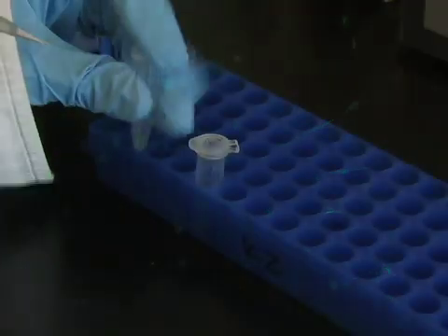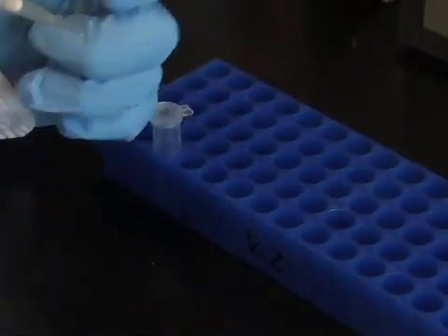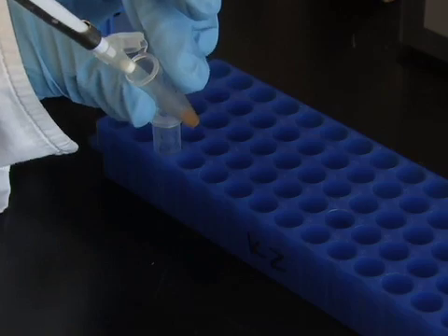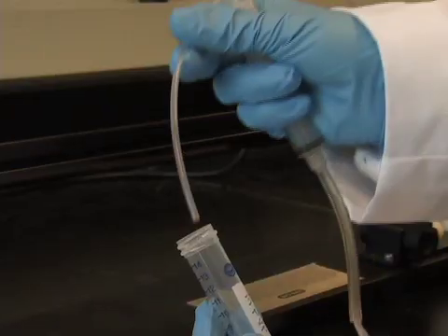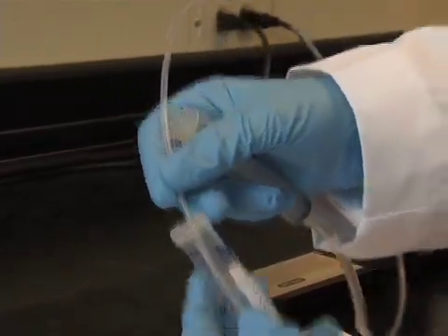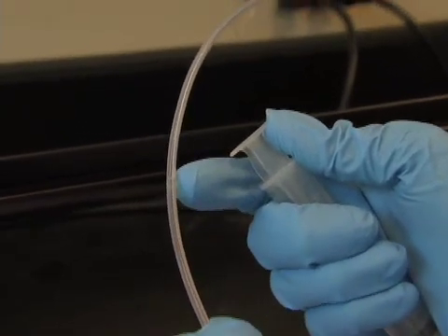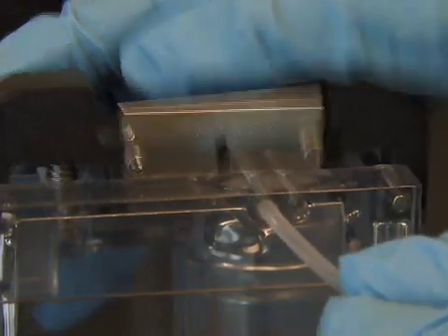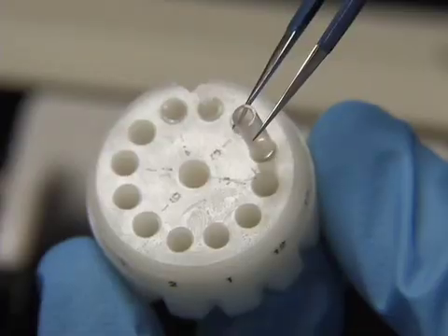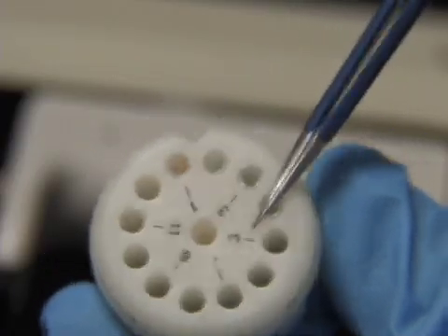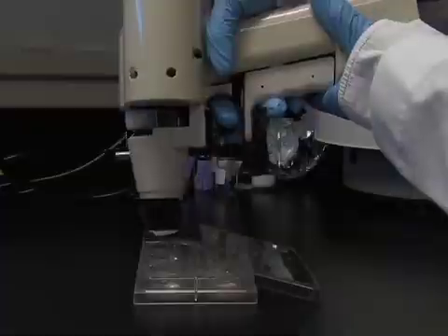The basic steps underlying biolistic transfection are to: 1. Coat gold particles with the DNA to be transfected, 2. Coat the inside of the plastic tubing with this gold, 3. Cut the tubing into cartridges to load into the gene gun, and 4. Shoot the tissue to be transfected.